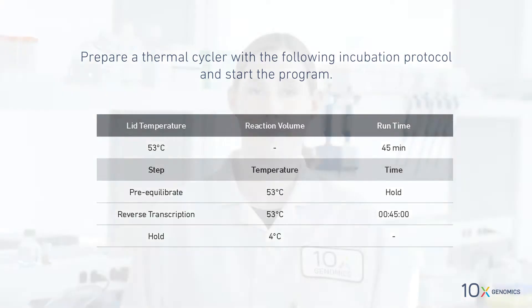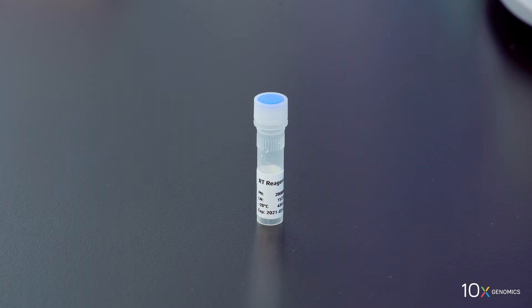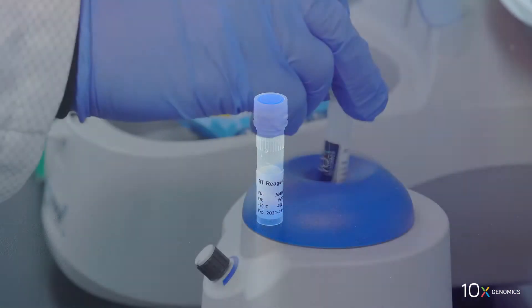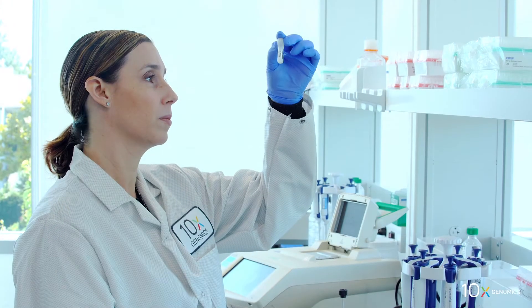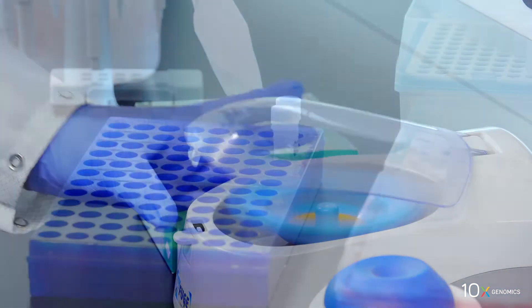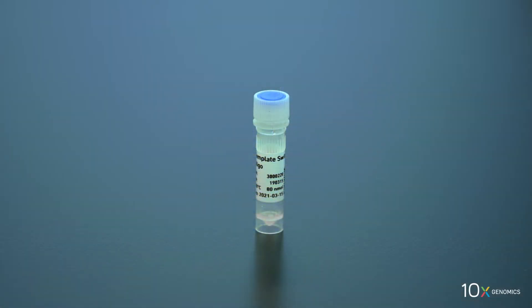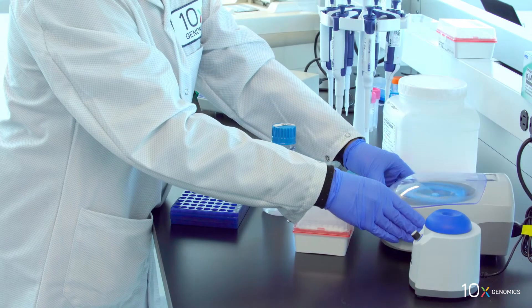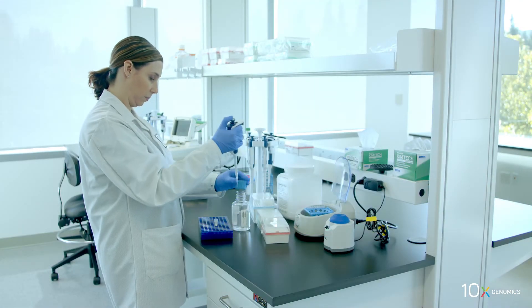First we will prepare the reagents. We have RT reagent: thaw, vortex, verify there is no precipitate, spin down briefly, and equilibrate to room temperature. Then we have template switch oligo: spin down briefly, resuspend in 80 microliters low TE buffer.